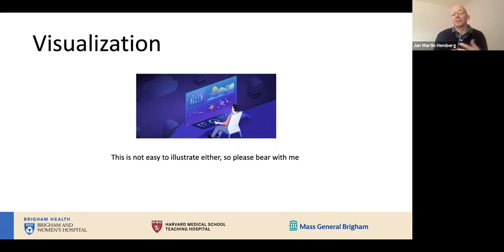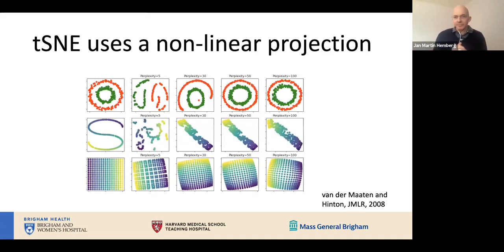So PCA will work well for really small data sets, so up to a few hundred cells. But as soon as it gets larger, you'll probably need to resort to some sort of nonlinear method to better position your points from the high dimensional space into the 2-dimensional plane. There are lots of methods around for this. What was initially the most popular one is called T-distributed stochastic neighborhood embedding, or t-SNE for short.